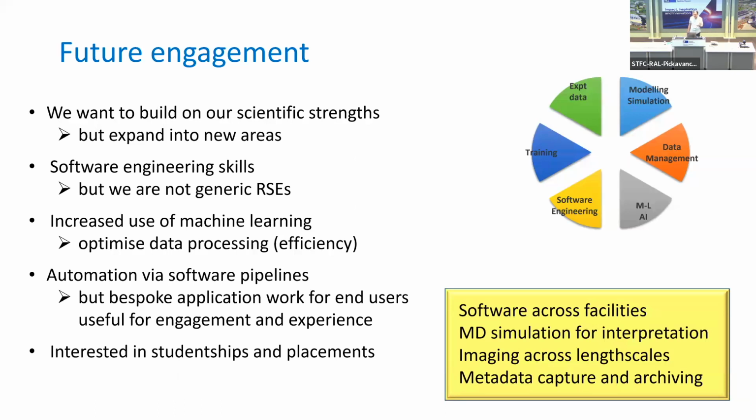Can we do data collection in a more intelligent way, rather than what the crystallographers used to call the American method, shoot first and ask questions later? Can we use machine learning to learn what works and use that to inform future experiments?